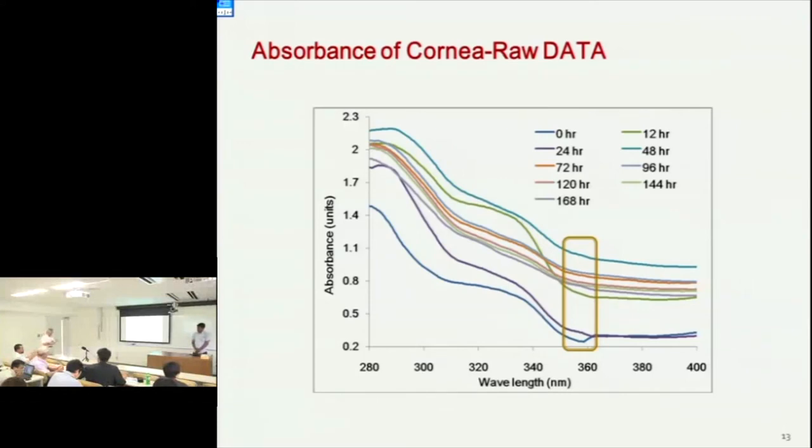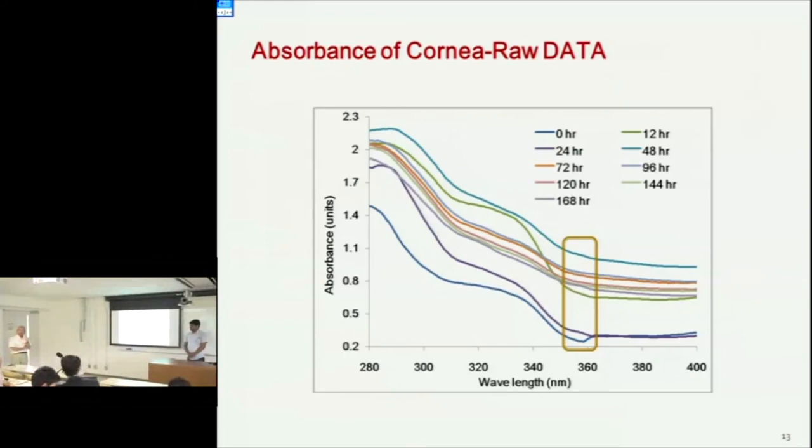If your sample holds some water, maybe... We use the reference as air here, but the cornea or lens or gel may hold some water. So we will be thinking about a different reference next time. In a short time, they may change, yes, within 6 hours.